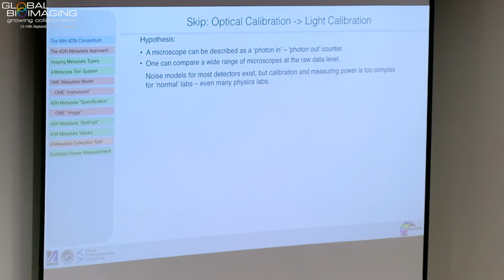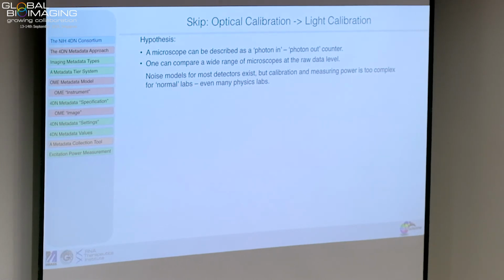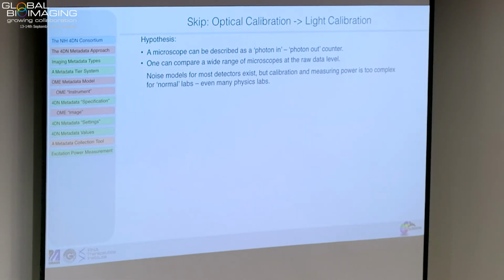If that is true, then there is another little curiosity. A lot of the methods that are used in imaging are so problematic because the heterogeneity in methods is really huge, right? We go from simple wide field systems through confocals to multiphoton to super resolution. But other than STED, most of these methods record a raw data image that is diffraction limited, and then process these images with additional information, like that is a distortion, or that is time information, but it extracts a process.